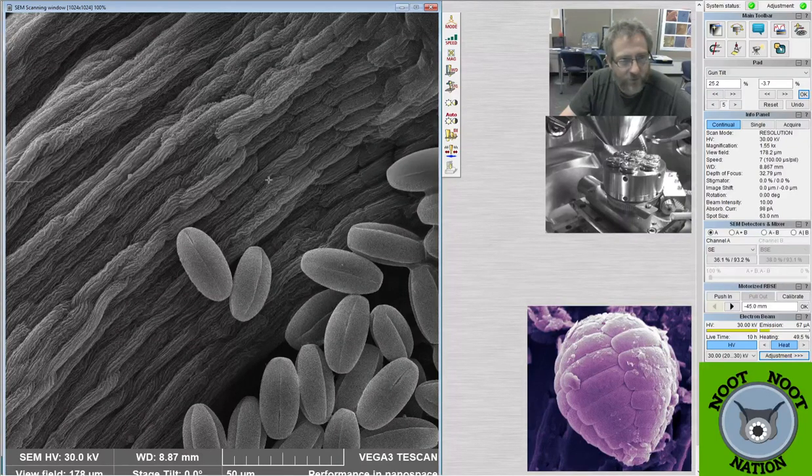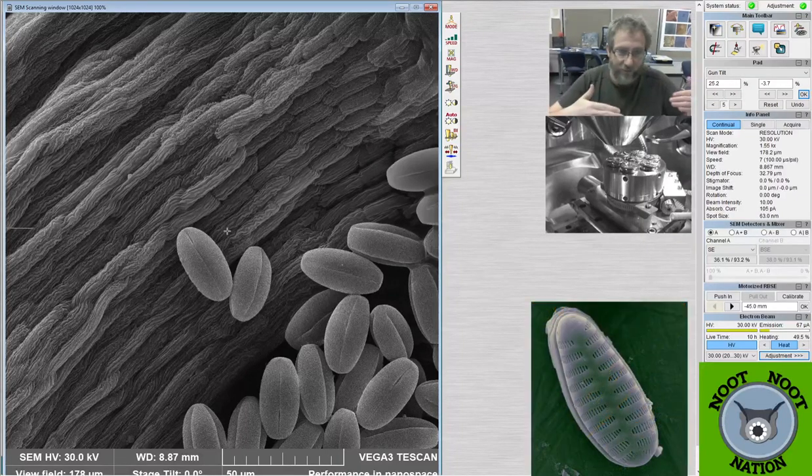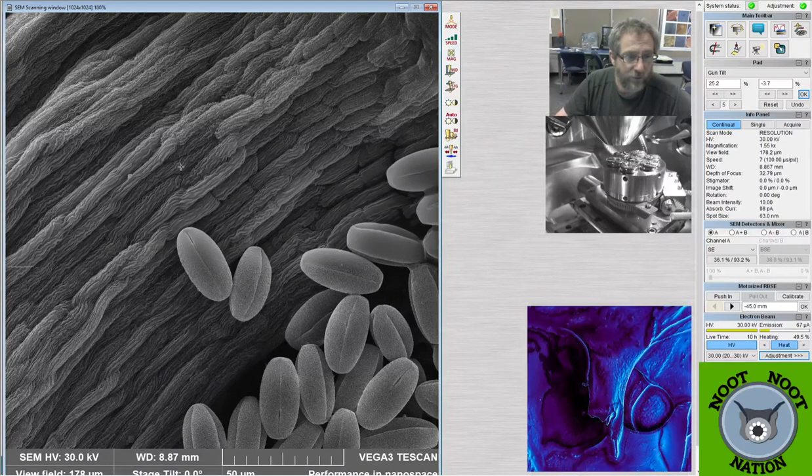You can kind of see as it scans, it's building the image. So people often, when I start to take a picture, they're like, oh, it's like it's from the 80s and you're trying to load a big picture on the internet. But actually, it's just how fast it's scanning. And I can set the scan speed. But the slower I set it, the higher the resolution of the image is. And when I have it on speed 7, which is where I'm going to leave it for this one, it takes about 3 minutes to collect the image.